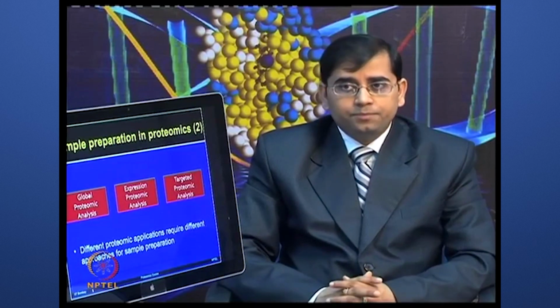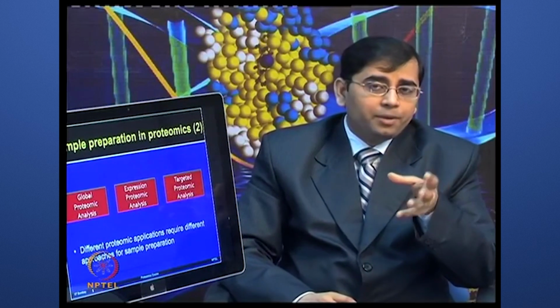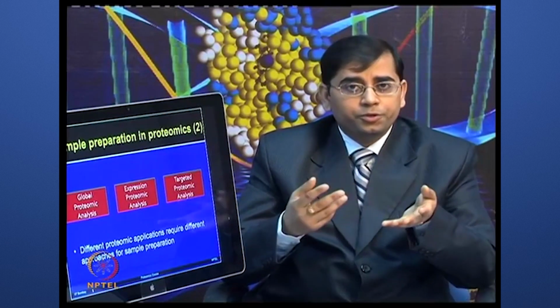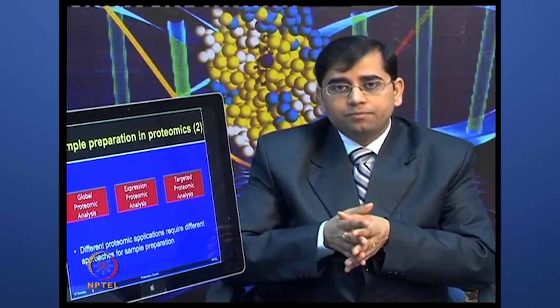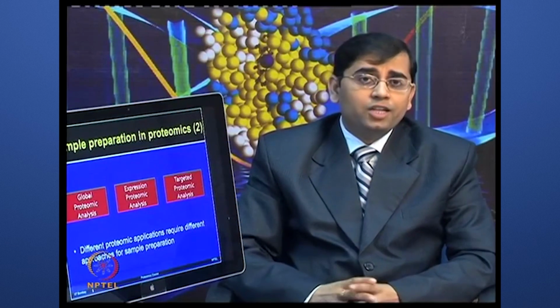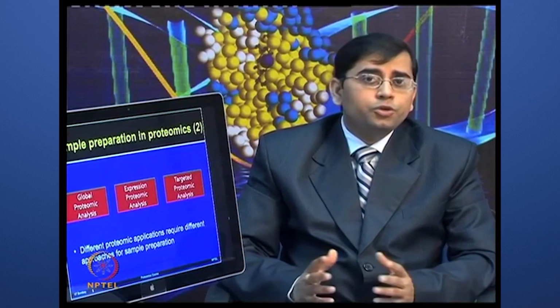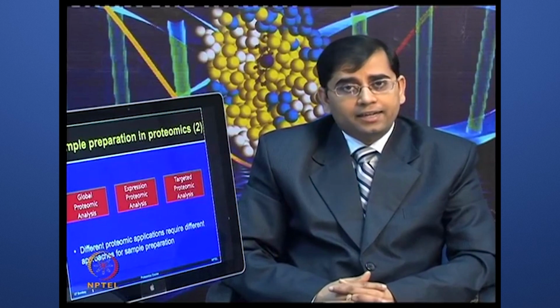Targeted proteomic analysis, if you are very focused on a given organelle or a given sample type, often you would like to know what is happening in that particular proteome, for example, mitochondrial proteome. So, one needs to try different types of strategies when thinking about performing a sample preparation. What is your objective? Whether you want to do global profiling or you want to do expression profiling, in either case you need to extract all the proteins present in that particular target sample.